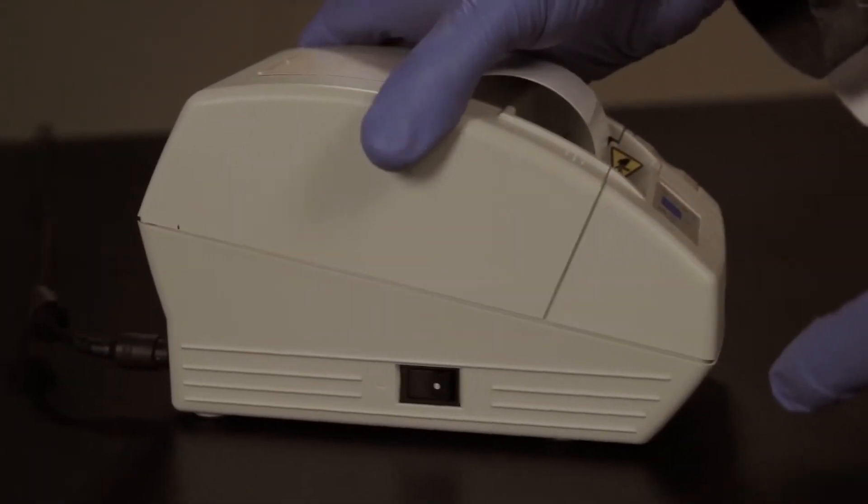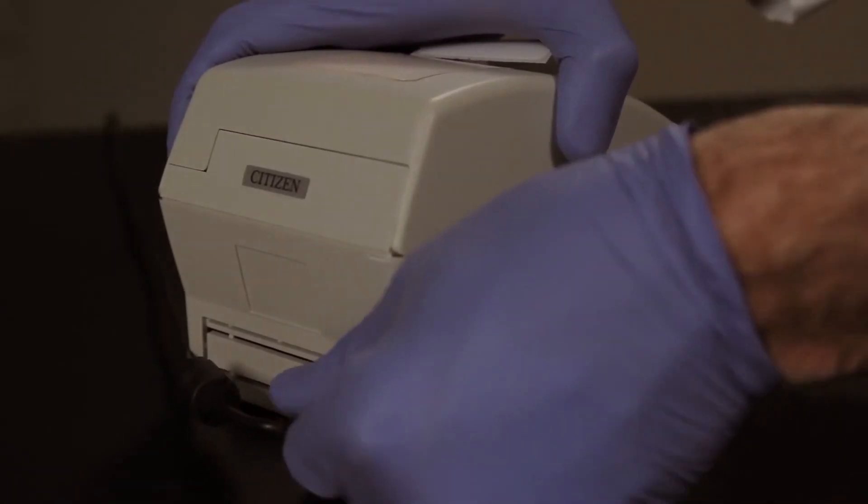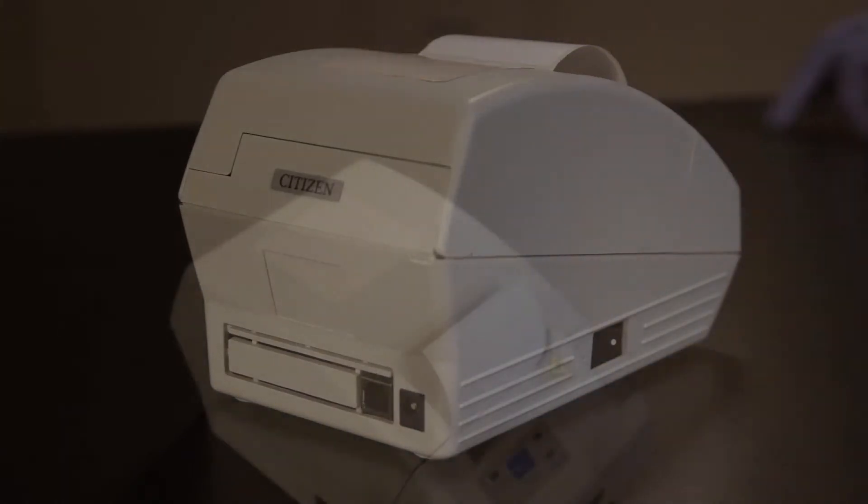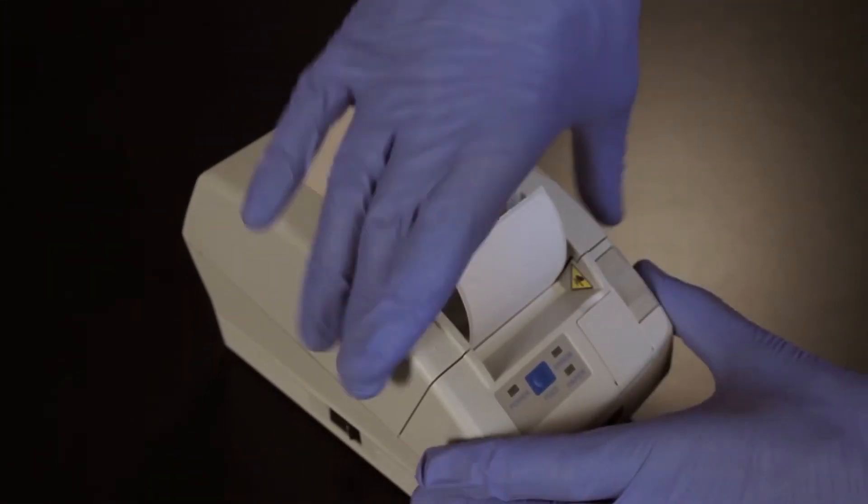First, turn your printer off and disconnect the power supply. Next, open the printer casing to remove the paper roll to reveal the print head.